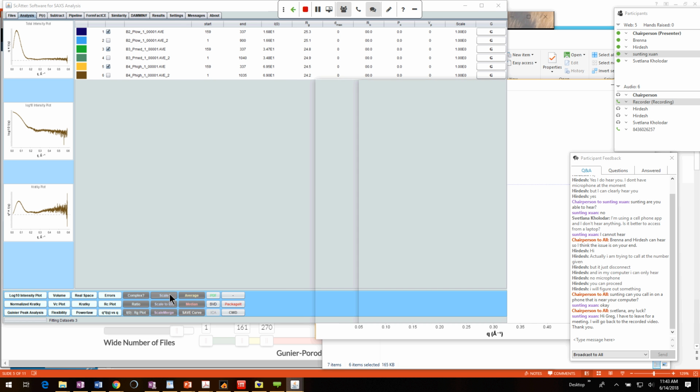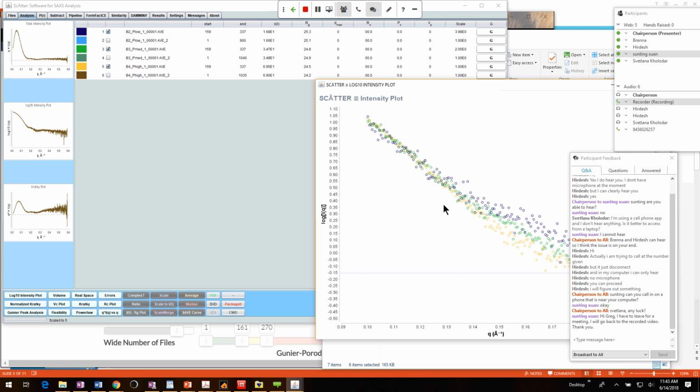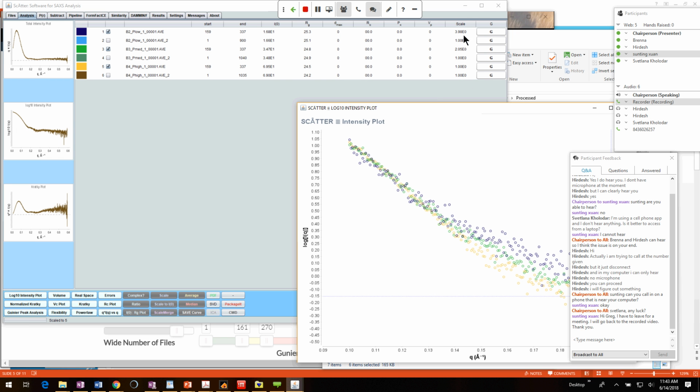Then I'm going to hit scale. In an area where the structuring isn't so big, although the low concentration noise is pretty high here, you want to superimpose them, and they should scale according to how you diluted them. Assuming the high concentration is 1 mg per mL, I scale the medium concentration by a factor of 2 and the low concentration by a factor of 4. They were just 2-fold dilutions, so that should go with your concentration dependence.